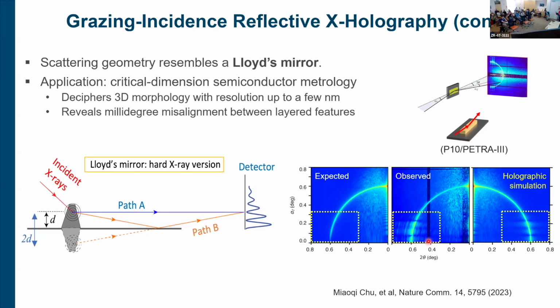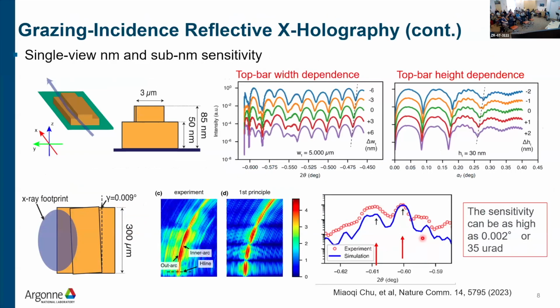Well, this sounds boring, right? What do you do with this? Actually, it has some applications that I will show you on the next slide. This is the first application, basically a demonstration. We have stacked samples over here, two lines. The first line is 50 nanometers, and the second line is about 35 nanometers. And this is the top view over here.